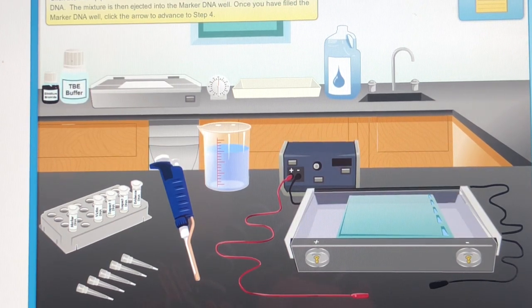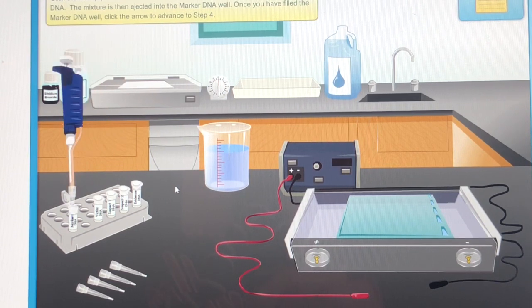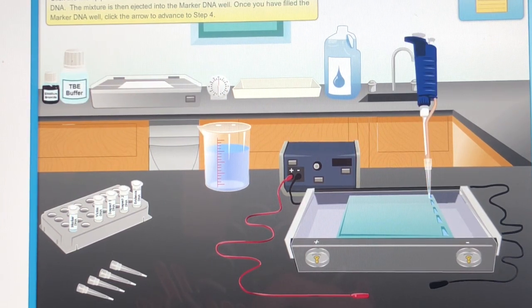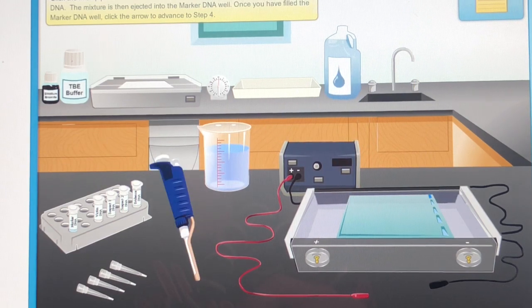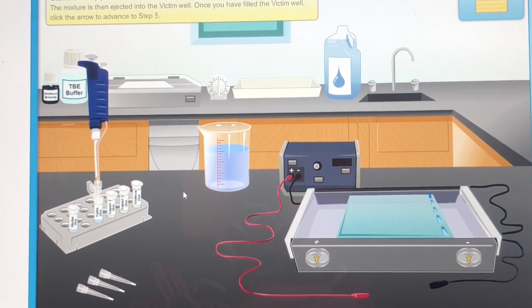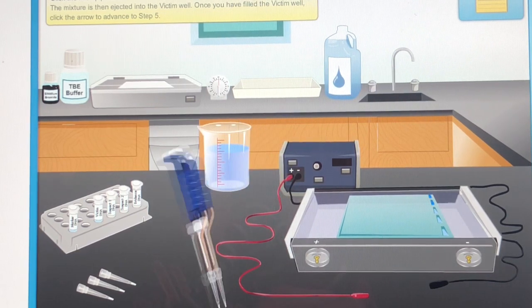Click the micropipet to load the bromophenol blue dye and mix it with a marker DNA. The mixture is then ejected into the marker DNA well. Once you have filled the marker DNA well, click the micropipet to load bromophenol blue dye and mix it with a victim's DNA. The mixture is then ejected into the victim well. Once you have filled the victim well, click the arrow to advance to step 5.